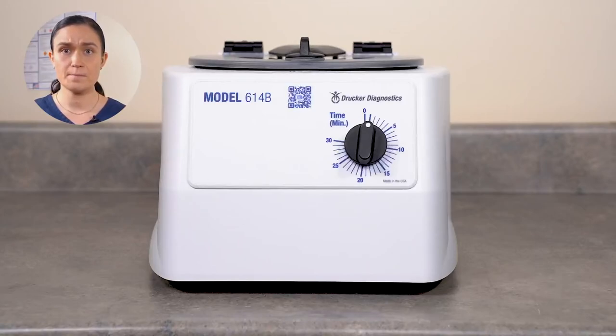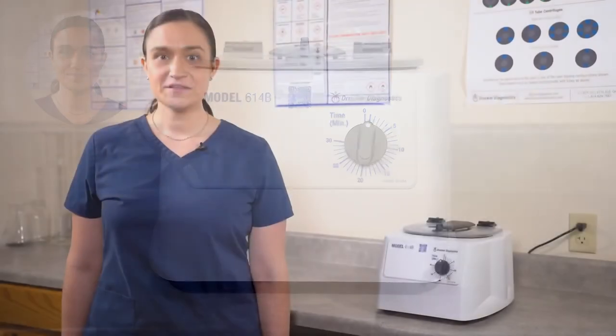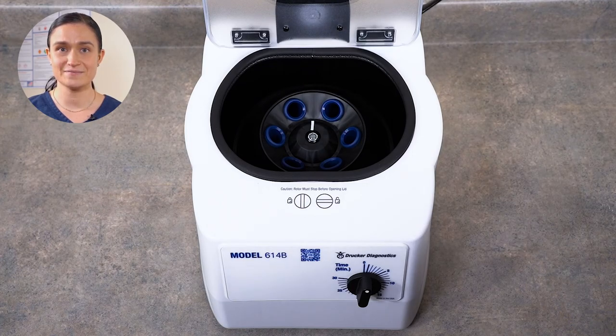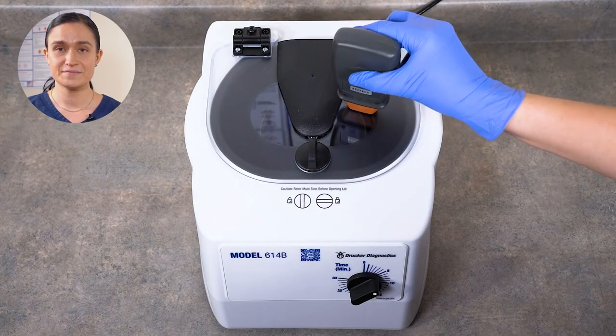If necessary, the rotor may be removed for easier cleaning. Links to our videos on how to remove and reinstall the rotor are popping up on your screen now. Dry your 614B immediately after finishing cleaning and disinfecting, and be sure it's plugged in so it's ready for the next use. Your 614B does not require any regular maintenance, but you may wish to confirm the spin speed. To do that, you'll need your facility's calibrated phototachometer. Your rotor has a reflective strip on it so the phototachometer can easily detect the speed. Start a five minute spin, wait a minute or so for it to reach its peak speed, and point your phototachometer down through the clear lid. You'll quickly get a reading.